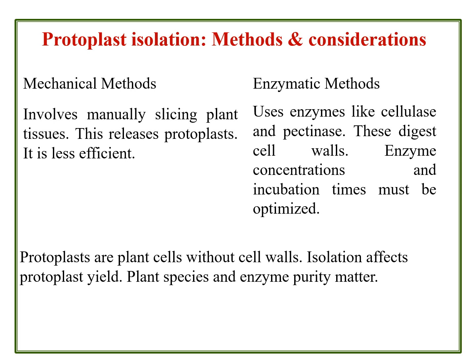The enzymatic method is more profitable; though it is costly, it is very useful and less laborious. Protoplasts are plant cells without cell walls. Isolation affects protoplast yield; plant species and enzyme purity matter.